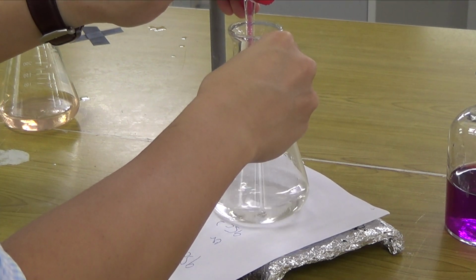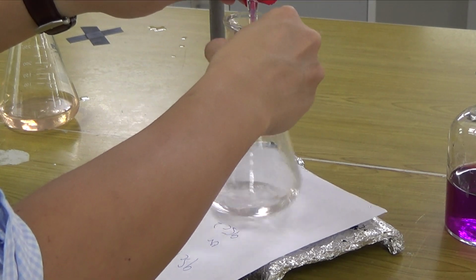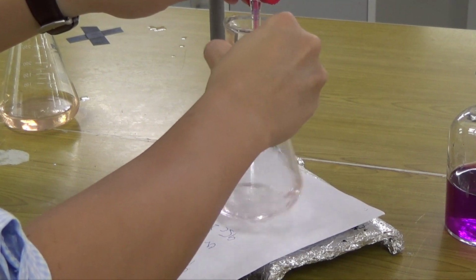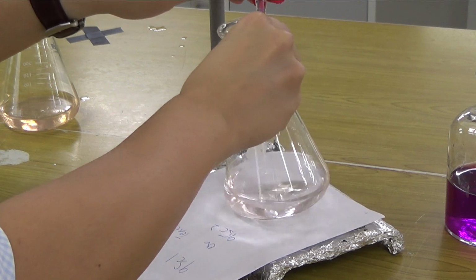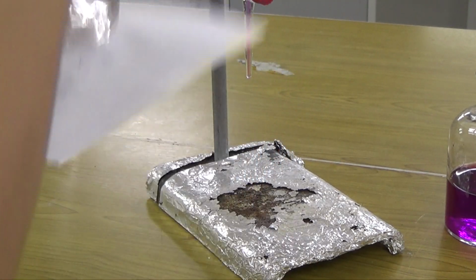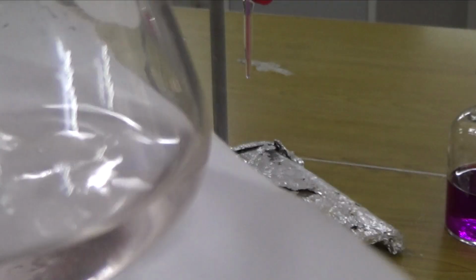So this is quite slow actually. So just keep on swirling and swirling, hands on the tap, and when it changes color permanently, when you get a permanent pale pink, then stop. Okay, so it's getting there, I think. Is it there yet? I think it's there already. I think it's just there. I think it is there. Just give me a minute, I've got one drop there. I think I've just reached the end point there.